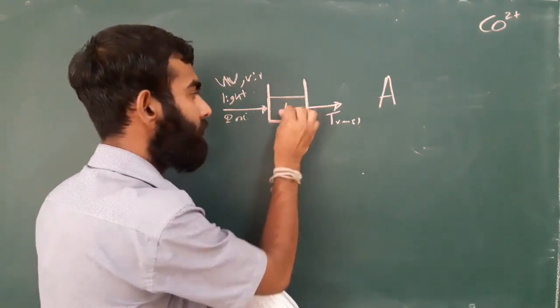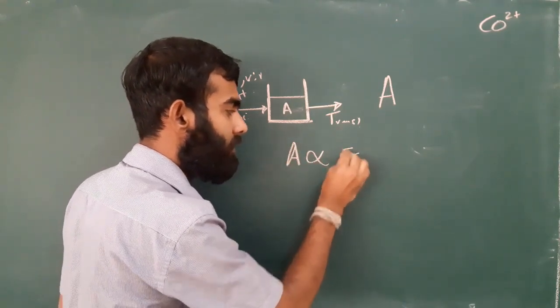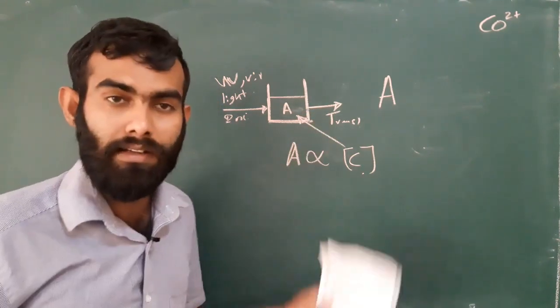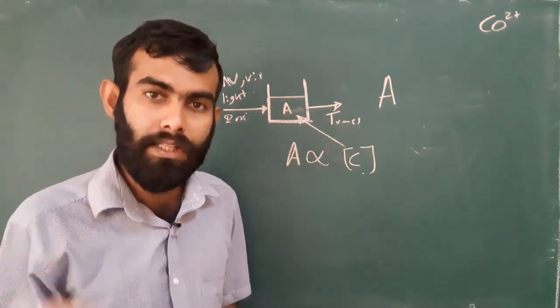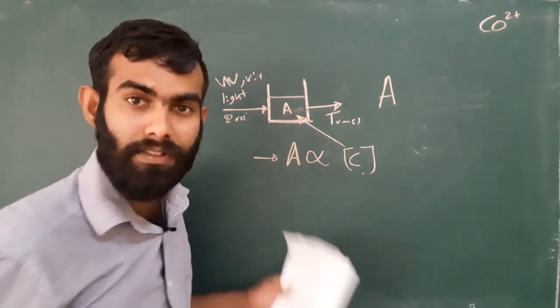That absorbance value A will depend on the concentration of the solution. Scientist Beer stated that absorbance is proportional to the concentration of the solution.